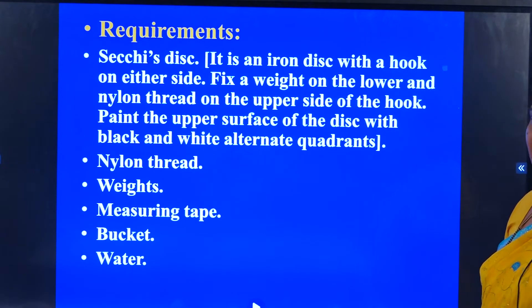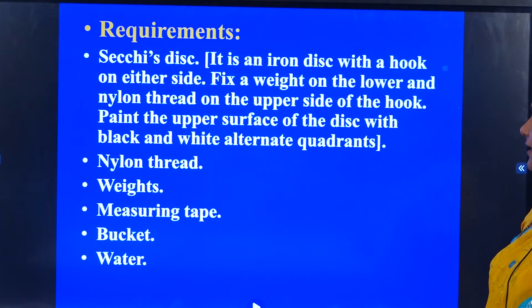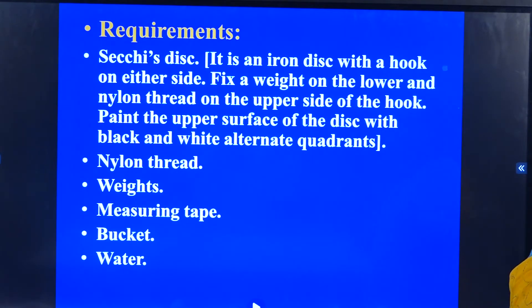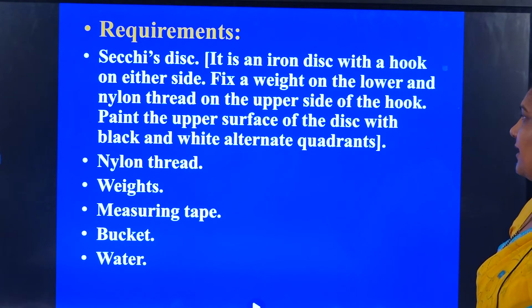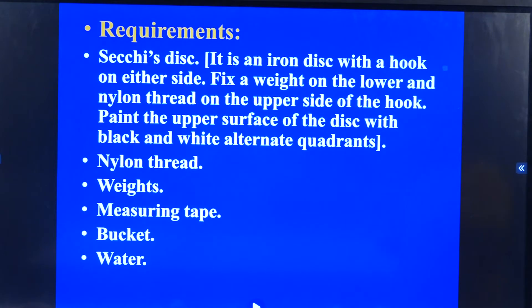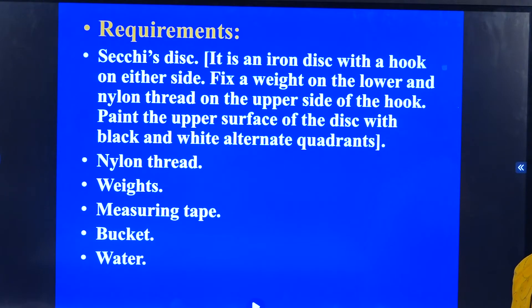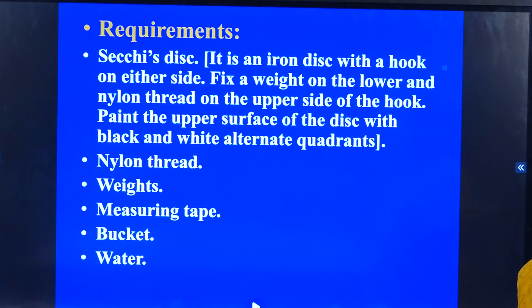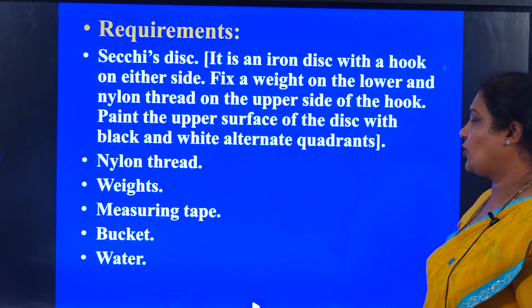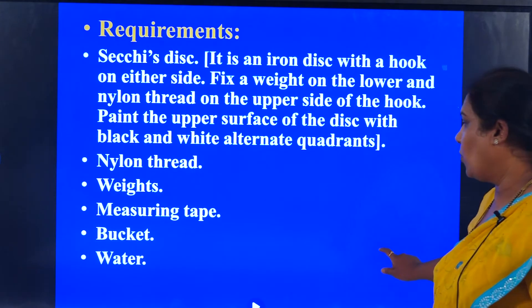The requirements for this experiment are a Secchi disc. On one of the sides we fix a weight, and a nylon thread on the other side, so the nylon thread would be on the upper side of it. We paint the upper surface of the Secchi disc with black and white alternating with each other. Then a nylon thread, weights, measuring tape, a bucket, and water.